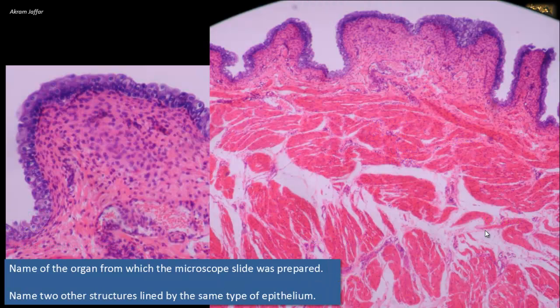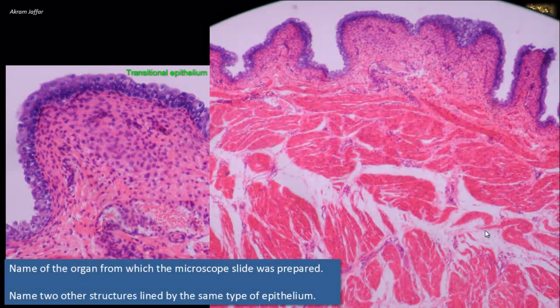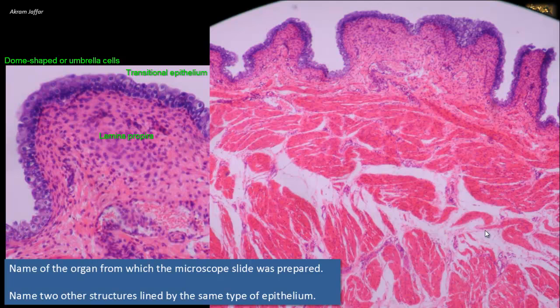Name the organ from which the slide was prepared, and name two other structures lined by the same type of epithelium. In the photomicrograph on the left, a magnified view of the transitional epithelium of the mucosal layer shows stratified epithelium whose surface cells, when relaxed, are cuboidal and bulge into the lumen — called dome-shaped or umbrella cells. The mucosa has lamina propria made of dense irregular connective tissue. The extensive muscular layer with irregularly arranged smooth muscle fibers allowing mass contraction suggests the section is prepared from the urinary bladder.